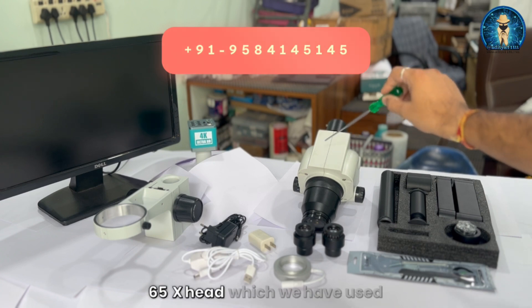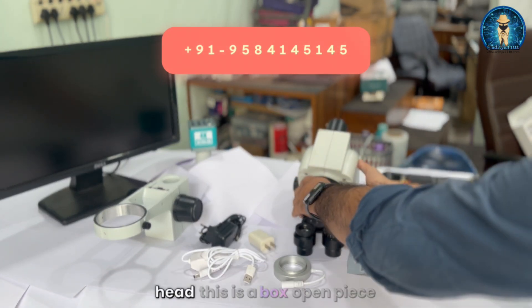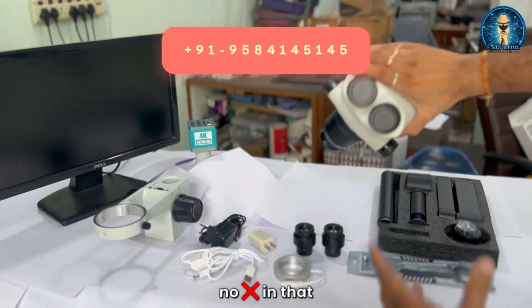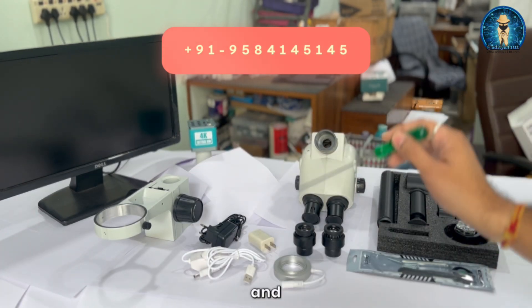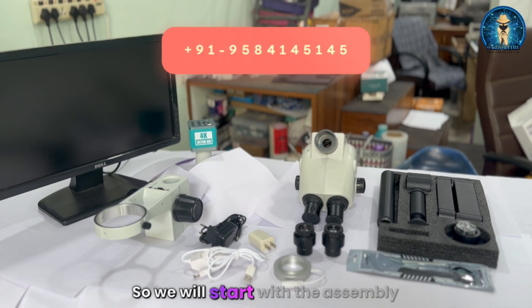This is a 65x head which we have used in the previous video. If you are going to purchase this set, we are going to provide you this head only. This is a box-open piece — you can see the condition. Apart from the head, this is the stand set we are going to use. You will also get two eyepieces, one light, a 4K camera, a holder, and an assembly kit. The screen is just for demonstration and is not included with the set.